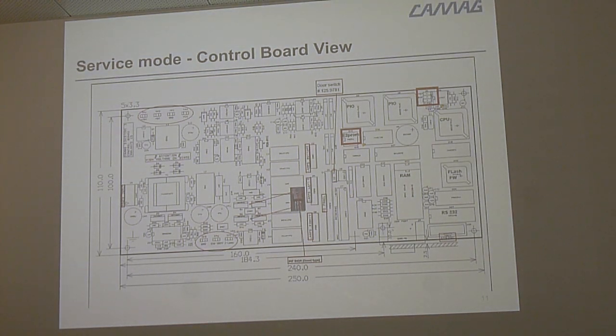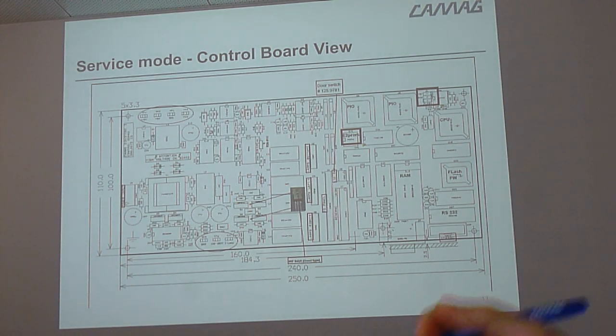So you can order it, or what you also can do, you can take out this EEPROM here and put it in the new board. This is working fine, as long as this EEPROM is not defective, but that is really a rare case. You just have to be aware, with the visualizer it's easy, it is the main board and it's clear, but on other instruments there are different boards, and on one board this EEPROM is.